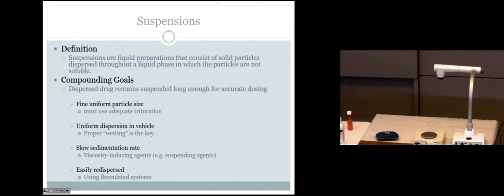How many of you worked in a pharmacy where at some point they made a suspension, or even if they took a couple of creams and just mixed them together, right? So it's pretty common. So we want you to have some fundamental skills with that. So they're not hard dosage forms, that's the good news. You just want to make sure that you do them well. So again, we'll do some real interesting ones. So let's talk about suspensions. They're not hard to make, but there's something to it.